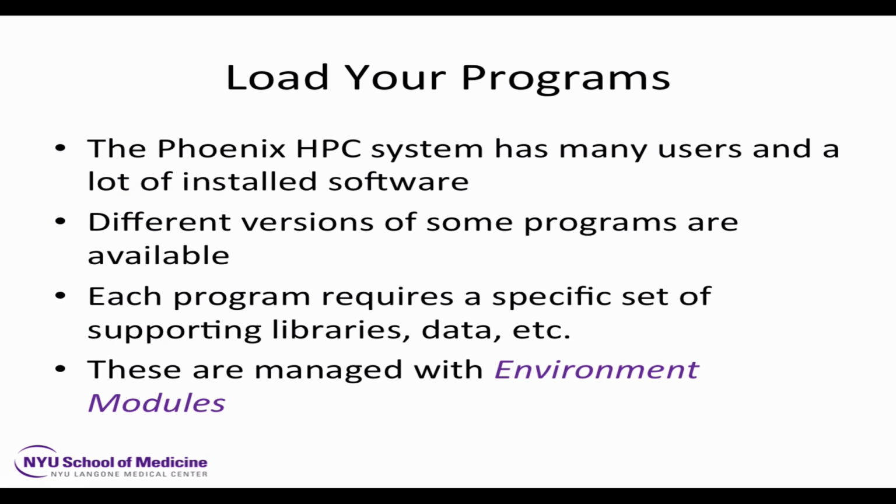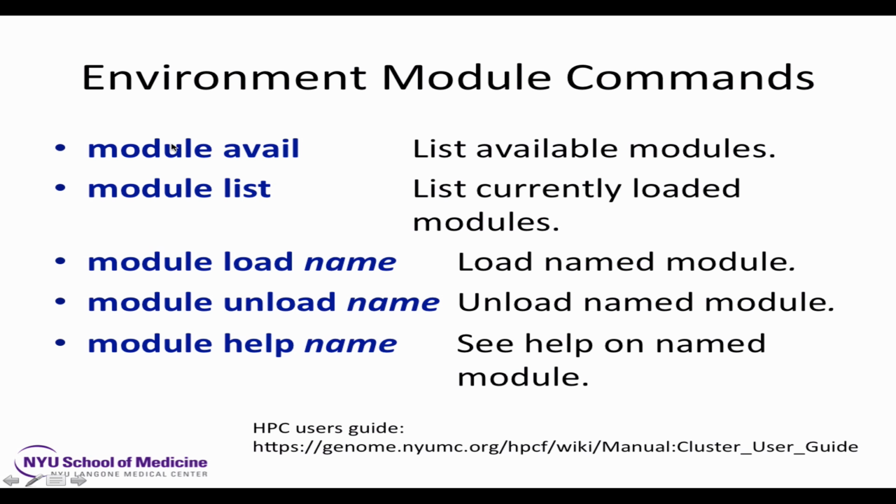All right. We also talked about modules. All the software that we're going to use today requires several module load commands. These are not things that are always running and always available. You have to load them and all of their nested prerequisites. All of these things have multiple prerequisites that they call on. Each program calls subprograms in order to do its work, a specific set of supporting libraries, etc. And we use environment modules. We're going to use module avail and module load mostly today.